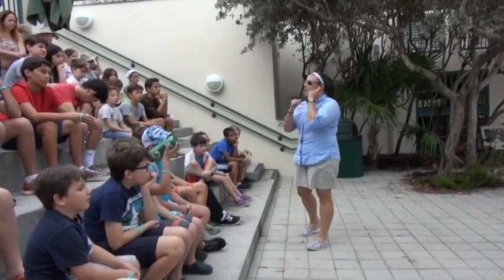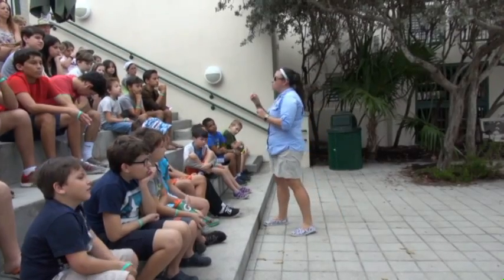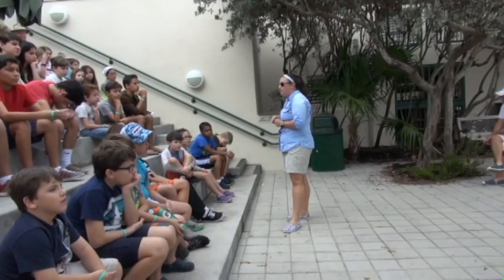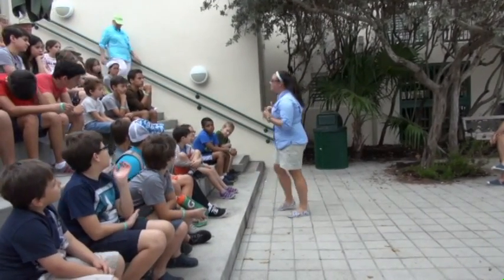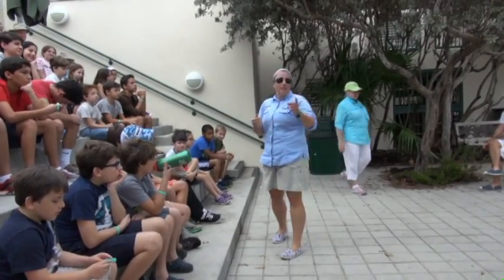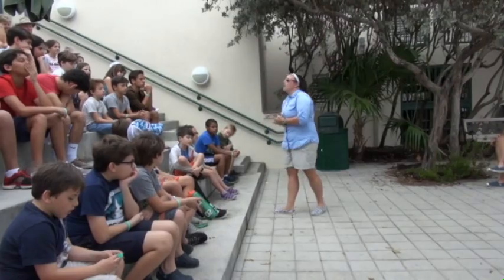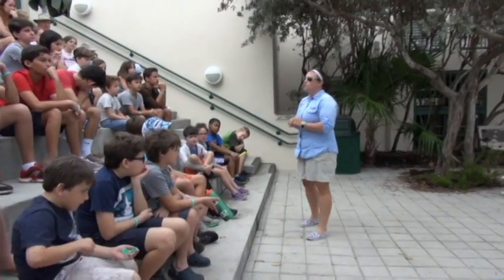Now, these teeth all point in the same direction, and in between those tiny little teeth are actual tiny little gel-filled pores. Believe it or not, that is their taste buds. So if I was a shark and I brushed up against you like this, technically, I would have been tasting you. They can taste with their skin. And just like how we lose teeth, these guys will replace their teeth or their scales throughout their entire lifetime.